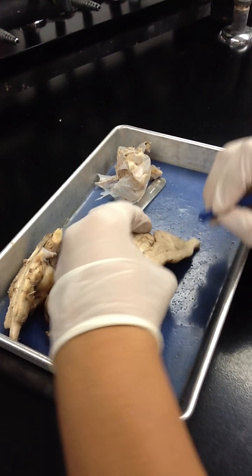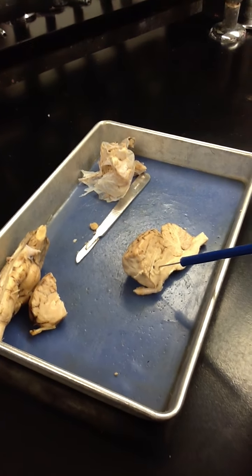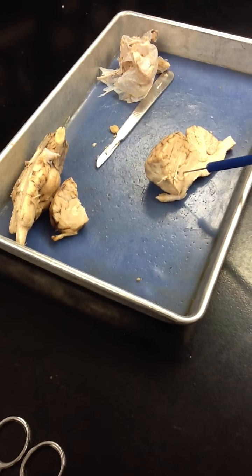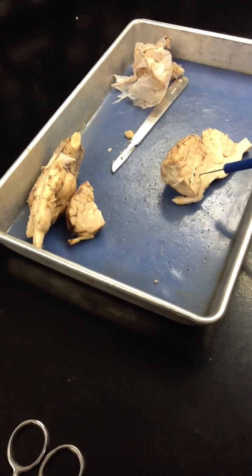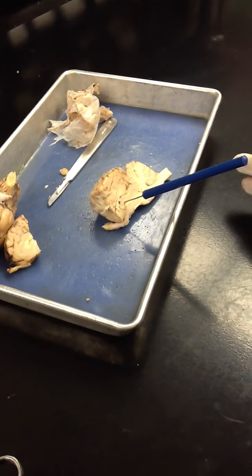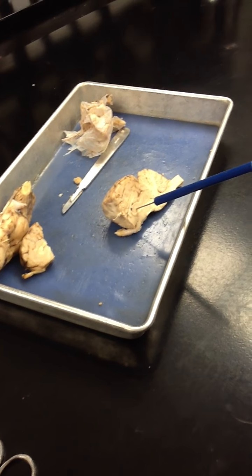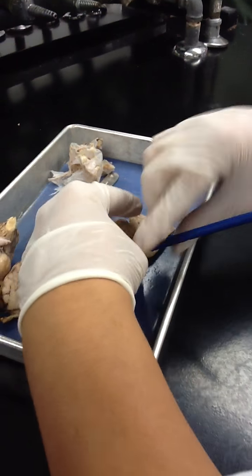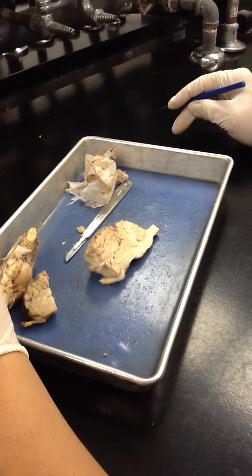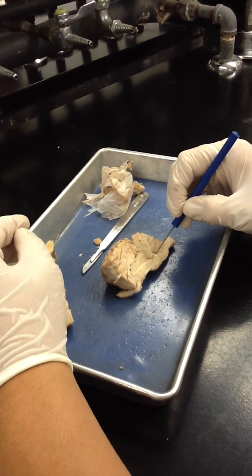Now, for the third ventricle, if it said name the structure for the wall, that structure would be the thalamus. Those make the walls of your third ventricle. There's a little space in between. Your third ventricle is kind of a flat space like this. The walls are the thalamus, and the space in the middle is the third ventricle. Then the third ventricle has a little canal called the cerebral aqueduct. It goes to the fourth ventricle, which is over here. Third ventricle's over here, fourth ventricle's over here.